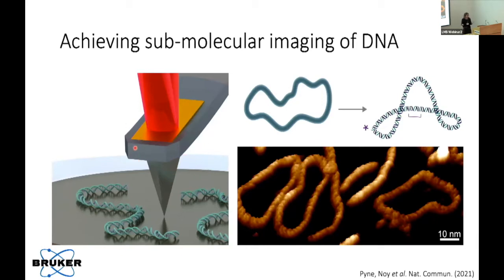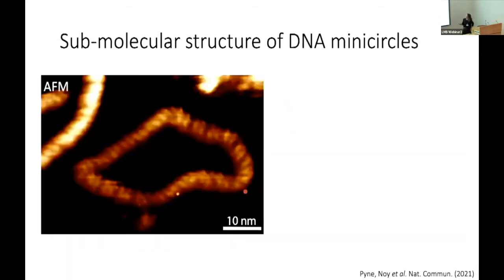So we can now do this reproducibly, and we can start looking at things on a much better scale and getting ends that are not quite so bad. And we can start looking at different populations of structure in DNA. So now we can do that. What can we do to actually start looking at DNA structure?